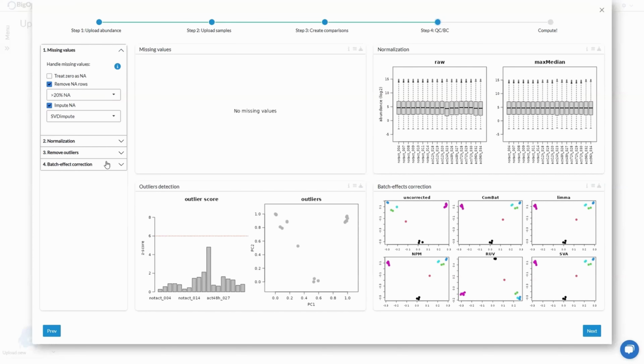However, I suggest for novice users not to just apply these randomly. There are actually quite a few drawbacks that come with imputation of missing values. So I would suggest you carefully read about imputation before applying it.